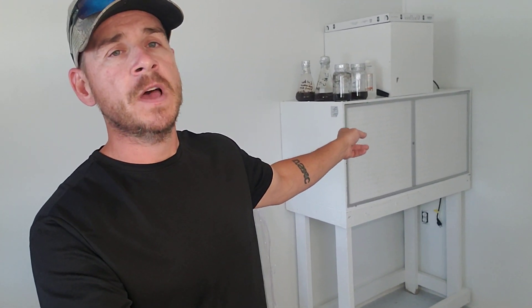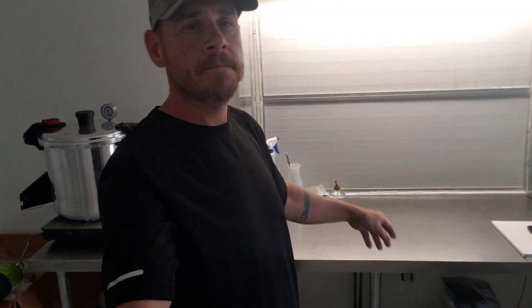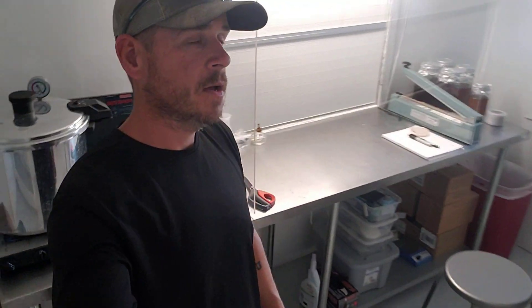I made a video when I built those. I brought one from Pacific, Missouri, my other place, and put it here. So I have this one — when I'm in here it will be circulating air. I did everything on the outside of the room. One, it makes it way quieter in here. Two, I utilize all of the space in here. There's not as much stuff in here, and you don't want a lot of stuff in your lab — it ends up getting in the way. So I plumbed everything on the outside.